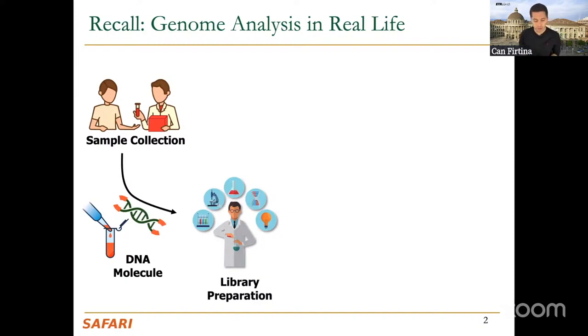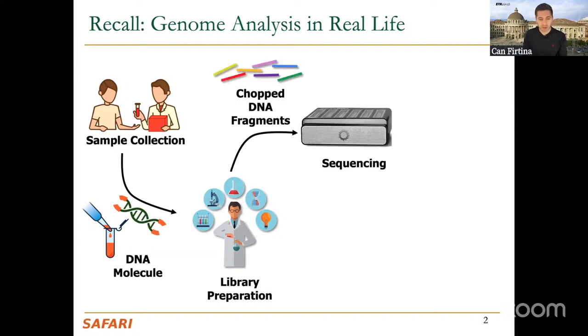The library is an intermediate step so that DNA can be read, sequenced in DNA sequencing machines, so that the DNA can connect to the corresponding parts in the sequencers and these machines can start reading it. This is a necessary step, perhaps for now, for the sequencing machines.